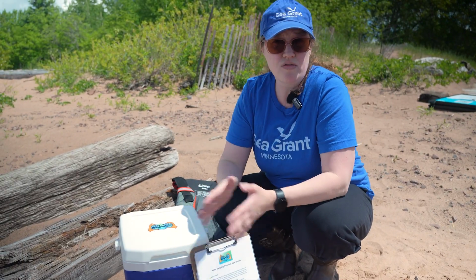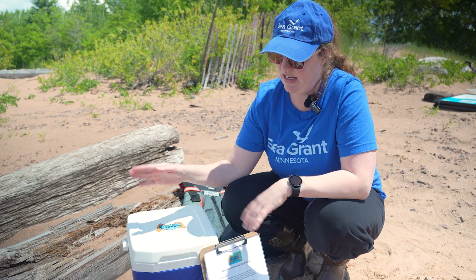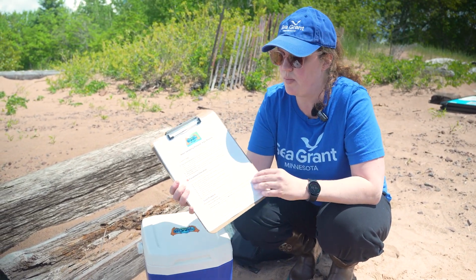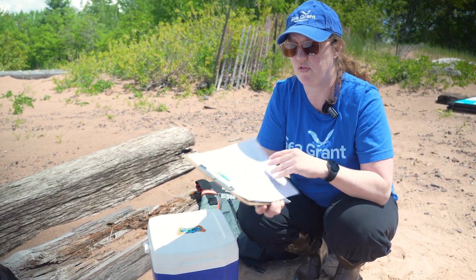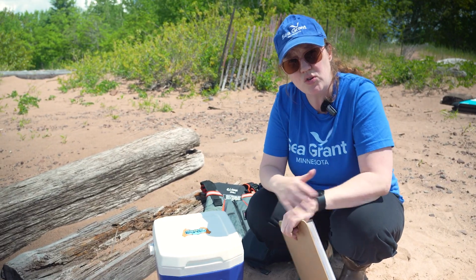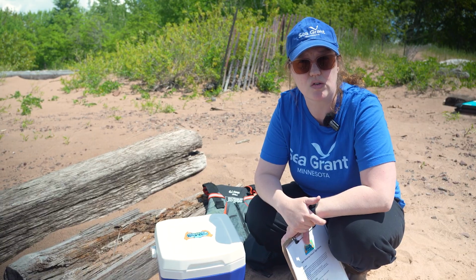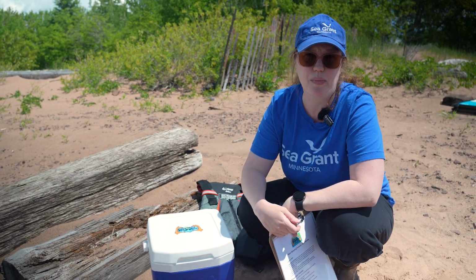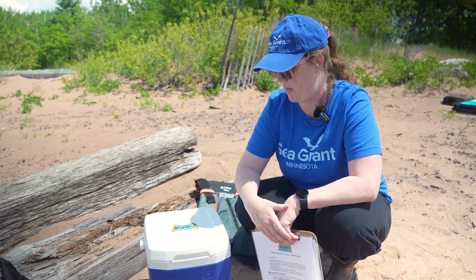So, when you are volunteering with this project, you will receive a sampling kit. It is going to be in a cooler like this. You will also receive a clipboard with a laminated water sampling protocol and a few data sheets printed on Write in the Rain paper. Also, you will become registered with an account on the project website, mnsg-mn-lake-lookout.org, and there you will also have digital copies of all the sampling protocols and data sheets, as well as all of the training modules.